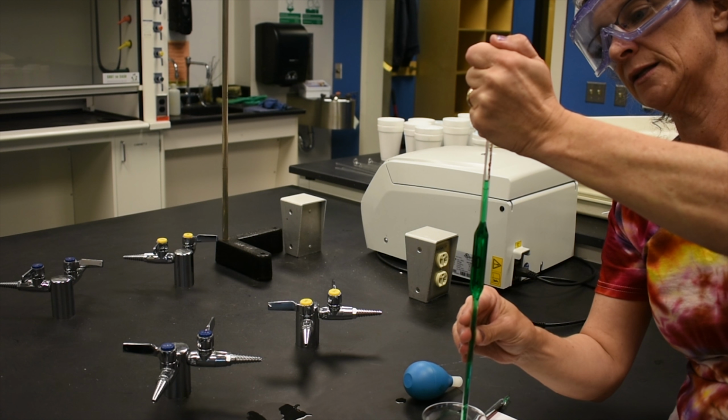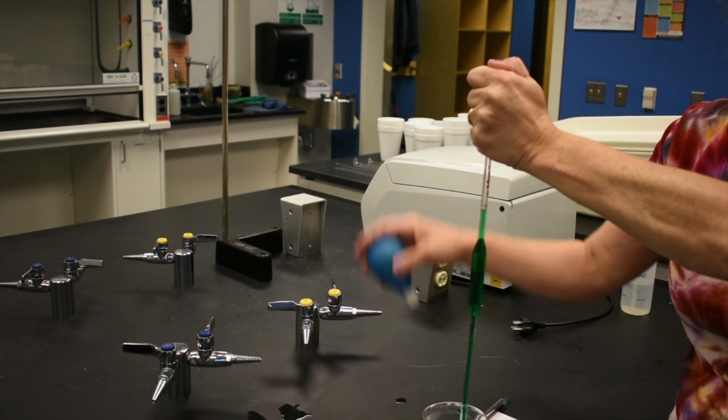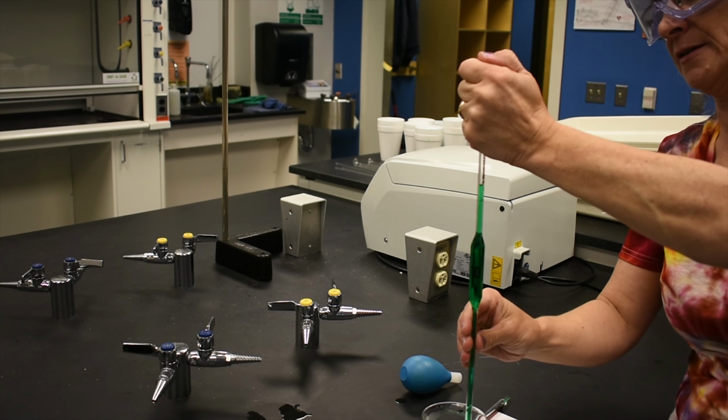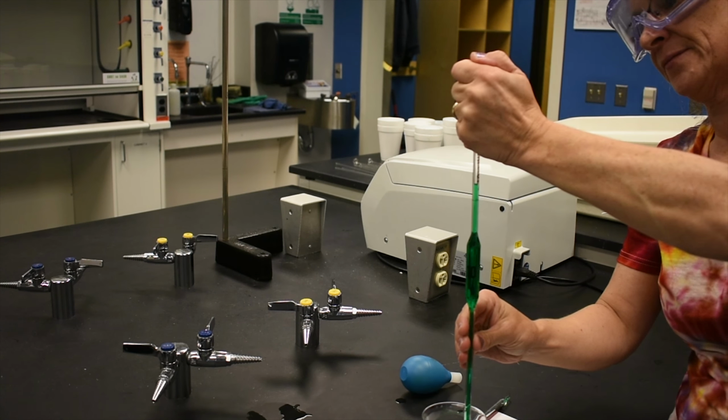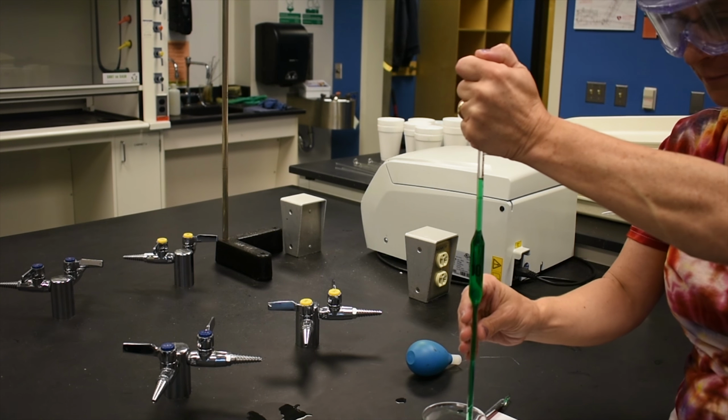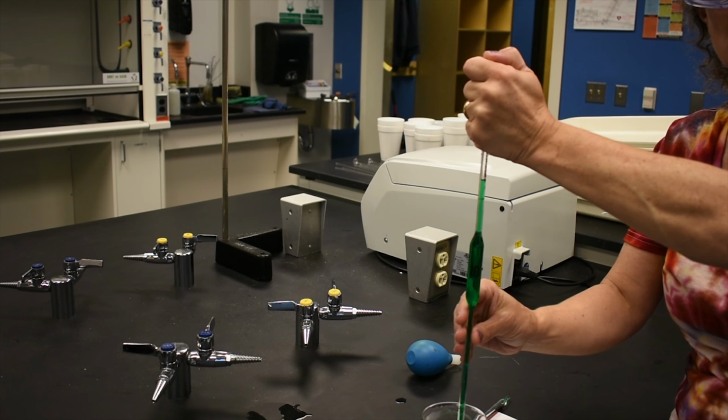I just quickly lift my thumb up and put it back, and again, I released a little bit too much. And as you can see, this takes practice. And it might take 3 or 4 or 5 or 6 times. So while I'm doing this, I will tell you that before you do this with the solution that you need to measure in lab, you should practice this procedure with water. Right now we're using water with green food coloring so you can see it better, but we are as well practicing with just water. I'm going to try to release my thumb again.